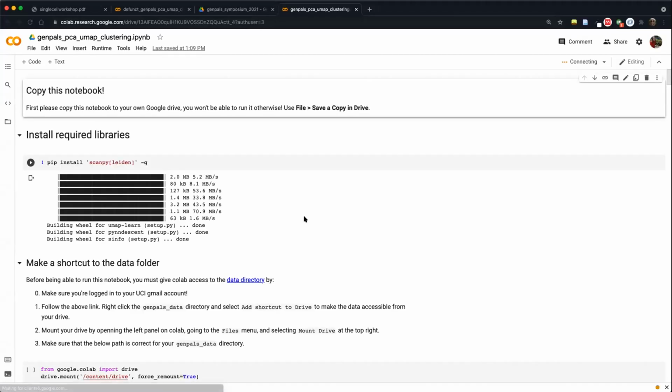I know that I had this pulled up somewhere else, but okay, here we go. This should be the one. It still says defunct. It wasn't showing output figures, and no matter how many times I restarted the kernel, it wouldn't work.